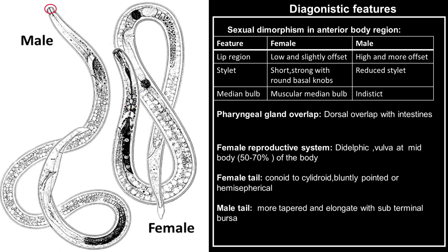Whereas in males, the head is high and more offset, their stylet is reduced, and their pharyngeal region has no distinct median bulb.